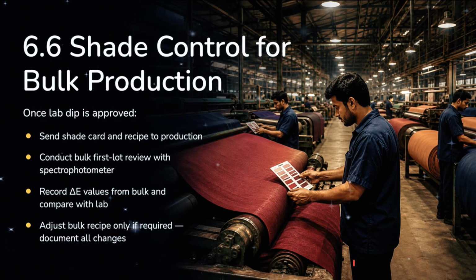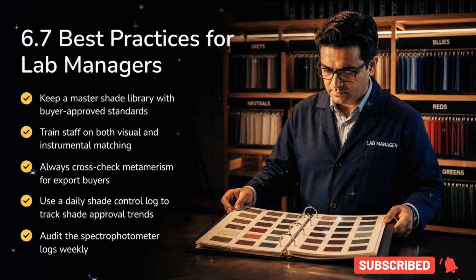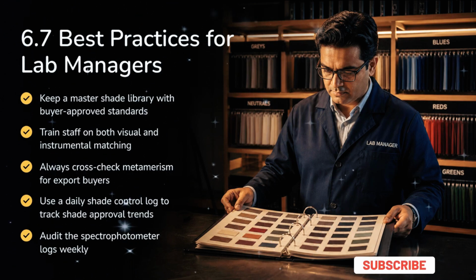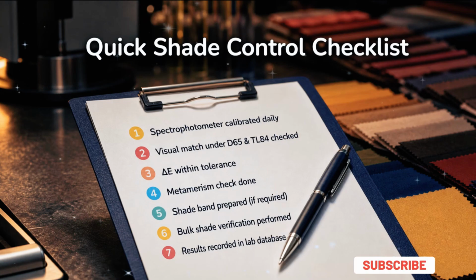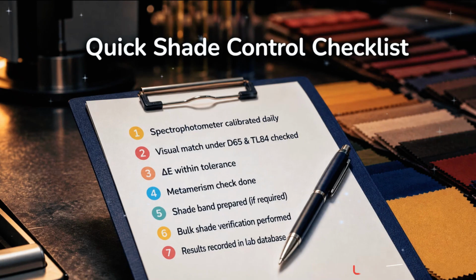documenting all changes. Best practices for lab managers include maintaining a master shade library, training staff, cross-checking metamerism for export buyers, using a daily shade control log, and weekly auditing spectrophotometer logs. Here is a quick shade control checklist to confirm all steps are complete: daily calibration, visual and instrumental matching, metamerism check, shade band prep, bulk verification, and data recording.